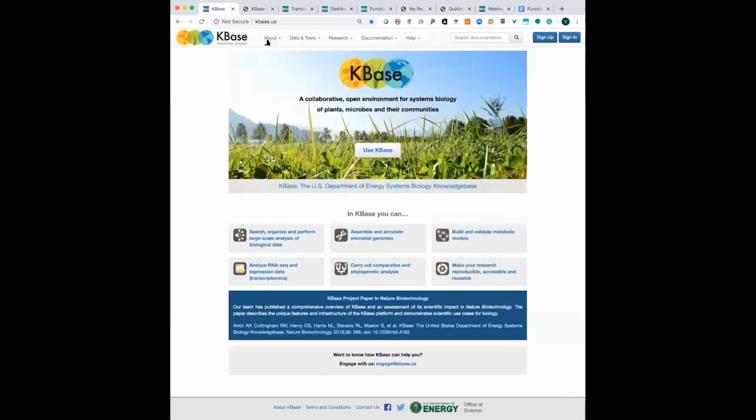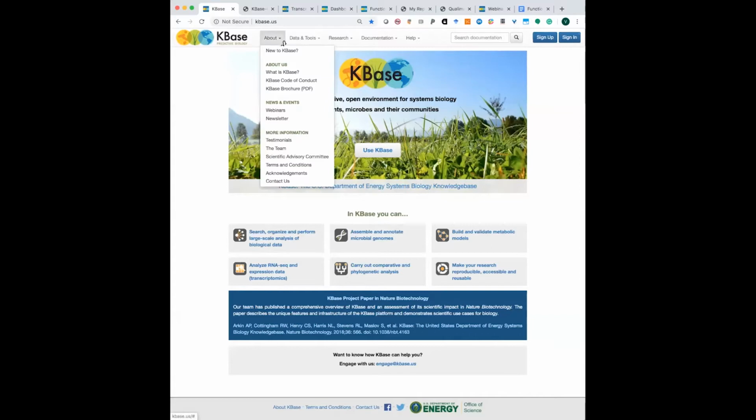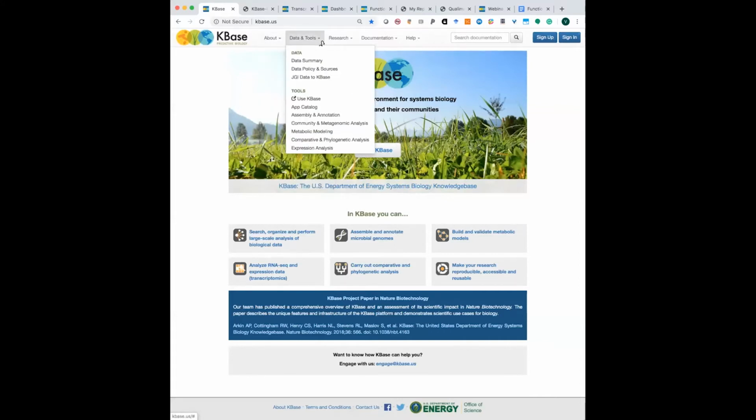So getting back to the other aspects of KBase, webinars and newsletter are something you probably are already well aware of. And for data and tools, expression analysis is the pipeline that we are going to be covering today.